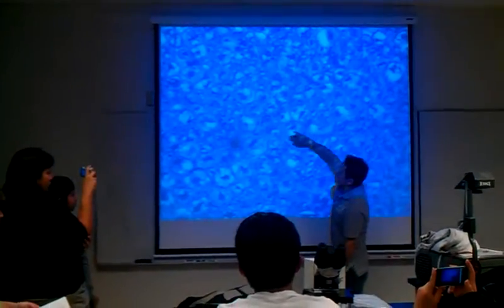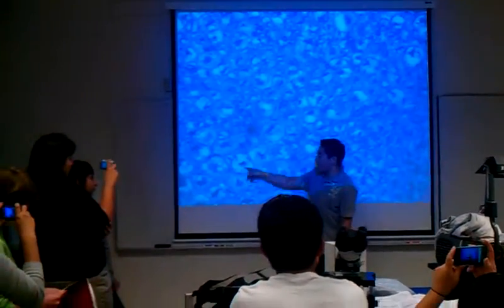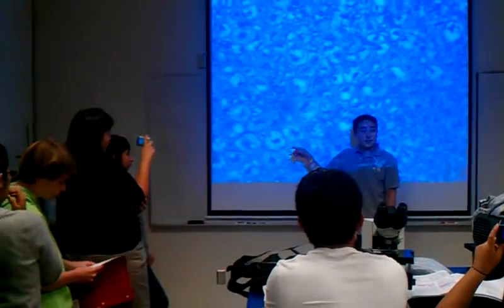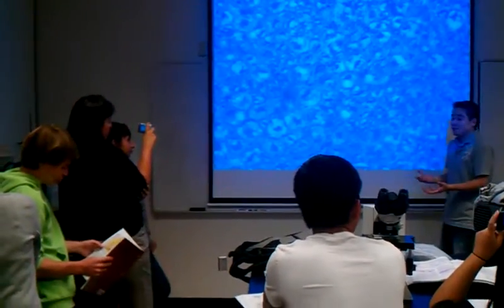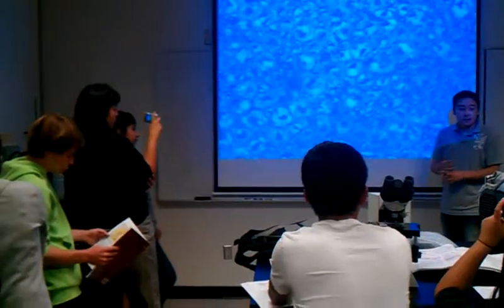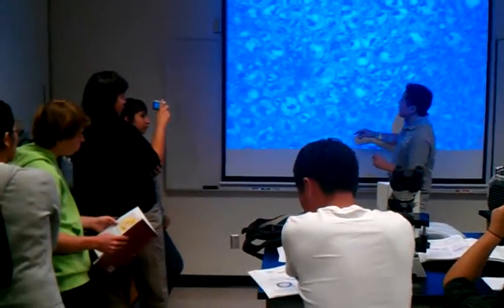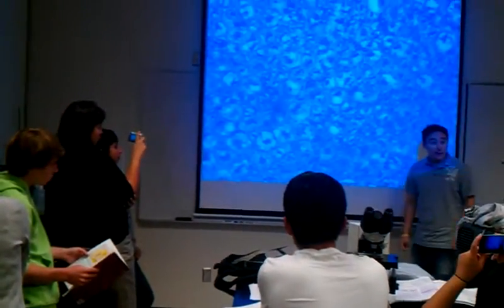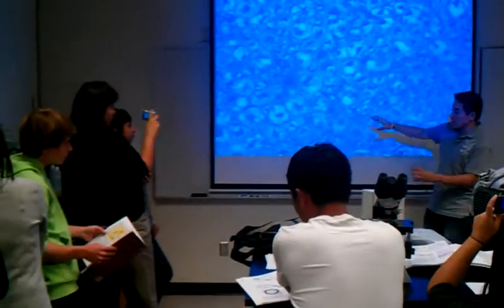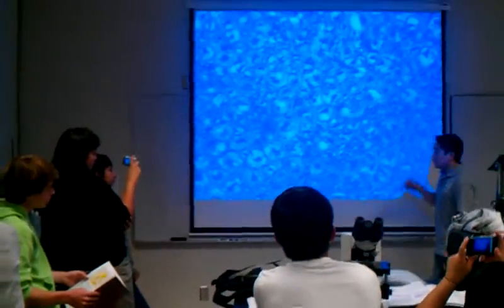These purple lines, right? That was the endoneurium. So what is this? Let's look at this one right here. There's this kind of white circle right here. What is that? The myelin sheath. It's also like the cytoplasm of the Schwann cell, because the myelin sheath is found within the cytoplasm of the Schwann cell. And then this dot in the middle is then what? Axon. If this outer area surrounding it is the myelin sheath, this is the axon.